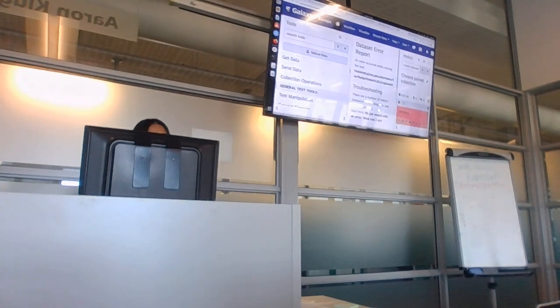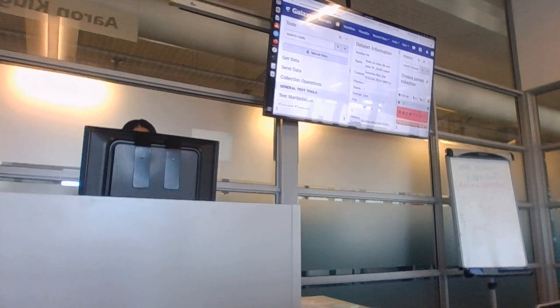Maybe it's different on your machine. Maybe because I can click once on everything and click away. Click on the info button and then click back on the bug. Anyway, this will give you an idea of what it is. Sometimes if you click on the info button it can give you more information. And sometimes they do populate this with sufficient information so that you know why the job failed.